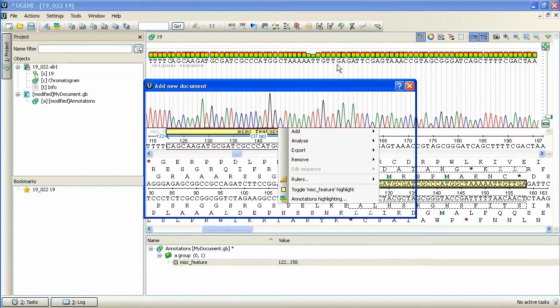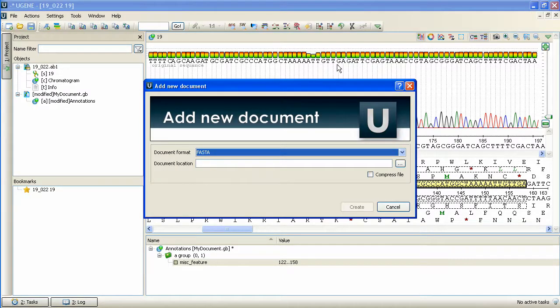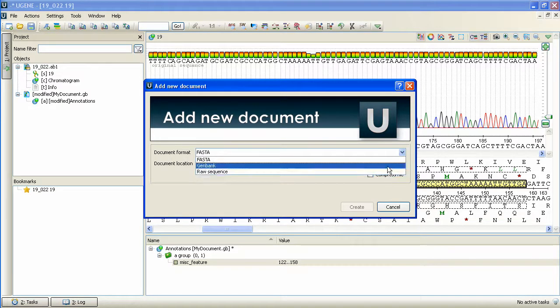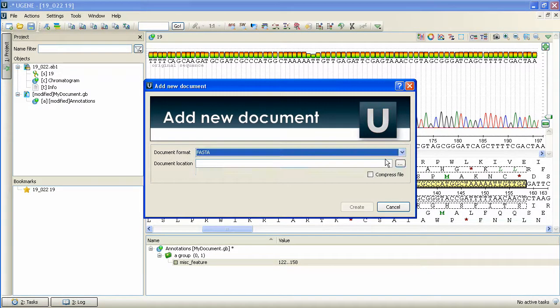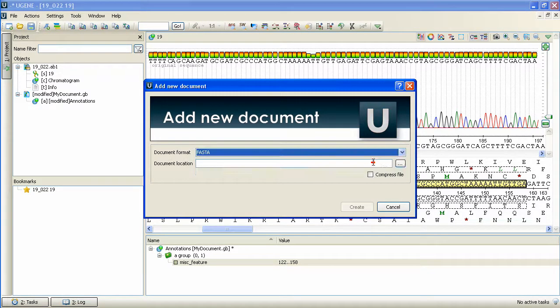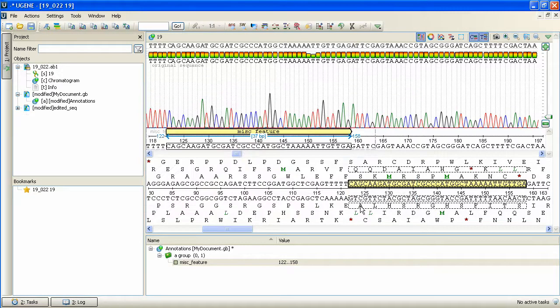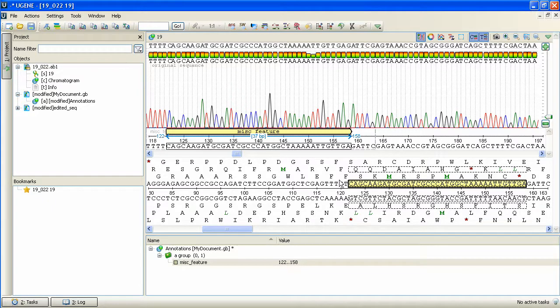Our new document dialog box has appeared. Here we can specify the file format and the document location and press Create. The new sequence has appeared at the top part of the chroma view.